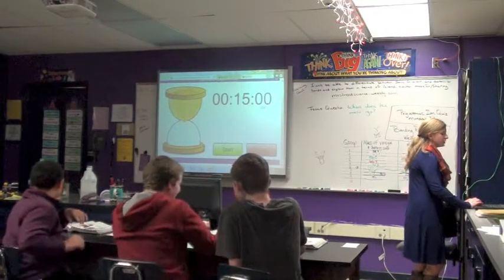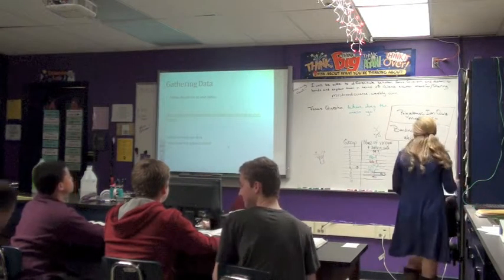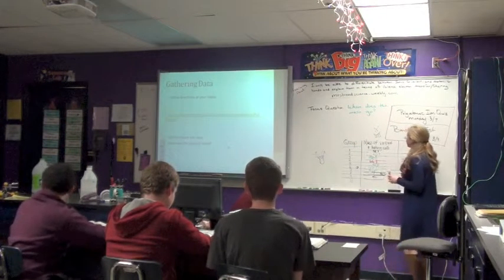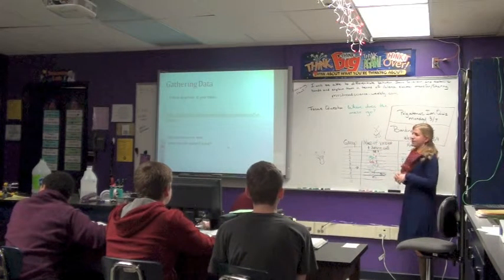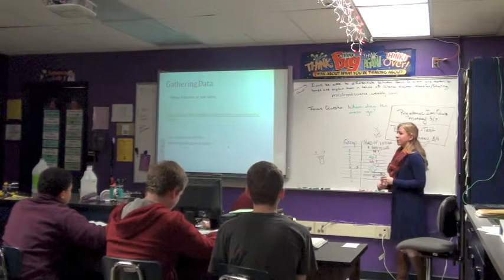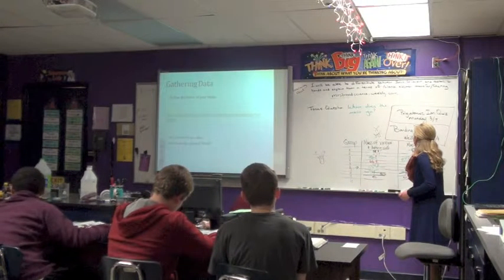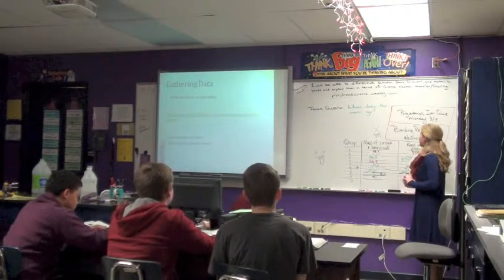So did every group get a chance to write their numbers up here? Yes. So let's look at the numbers that everybody got and try and figure out the general trend. Okay? So this first group. Remember that the vinegar and the baking soda are our reactants. Then these are our products. So remember, we're trying to answer, will the mass increase, decrease, or stay the same as we go from reactants to products? So this group started with 58.7 grams and ended up with 57.5.